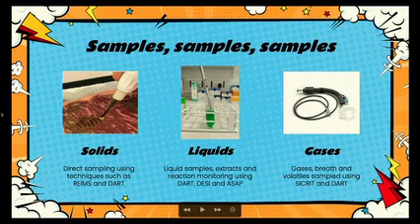That generates that smoke plume, which is then introduced into the instrument, and that's brought into the instrument largely by the instrument's own vacuum. It's not even necessary to include an additional vacuum system or anything. So again, that simplifies the introduction process.